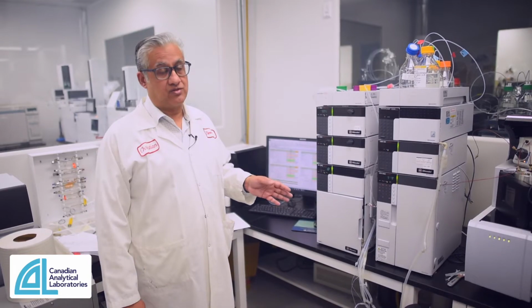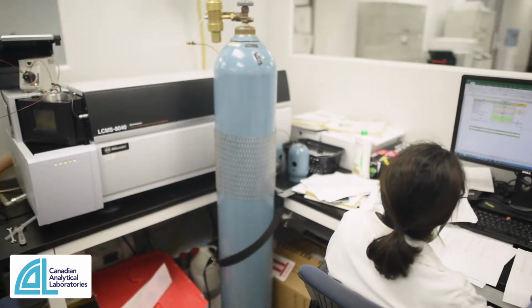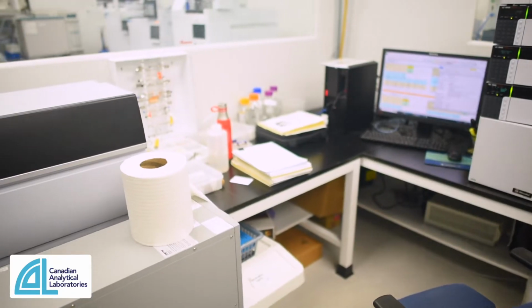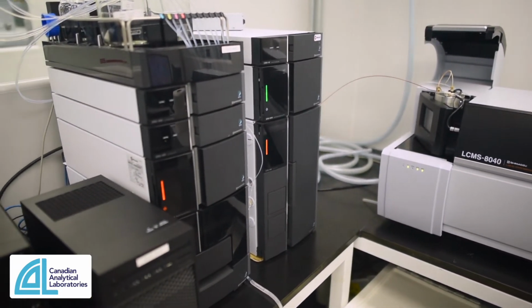So this is one of 4 LC-MS/MS triple quads that we have on site. These are Shimadzus. This is where the predominantly vitamin analysis is performed. Again, triple quad, so we're relying on secondary fragmentation patterns. You take the original molecular ion peak and subject it to a collision again, and the fragmentation pattern we select based on filtering for the m/z ratio, and link that to the unique identity of the analyte we're after. There are 2 here. These are high throughput, and there's 2 down the hallway that we'll see later on.